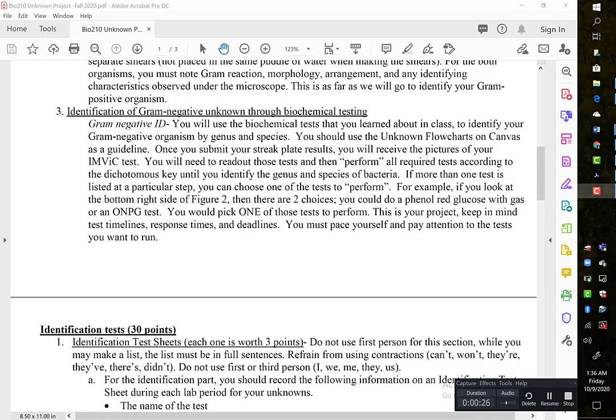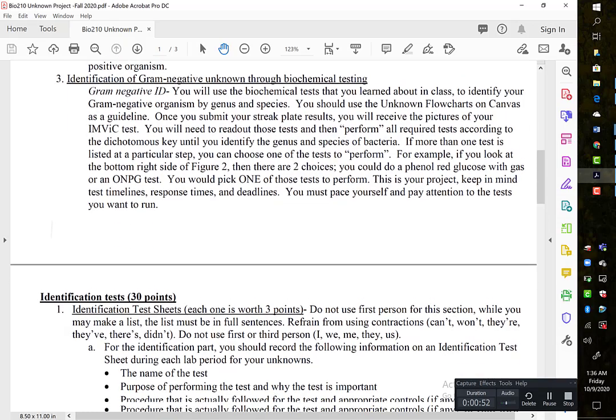And so this is your project, so make sure that you keep on top of your timelines, the response times, and the deadlines. You need to pace yourself and make sure that you submit things early so that you have enough time to get a response so that you can submit the next part of your test. And so you would do your biochemical tests until you identified your gram negative.